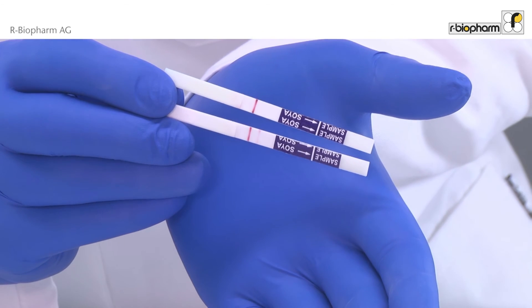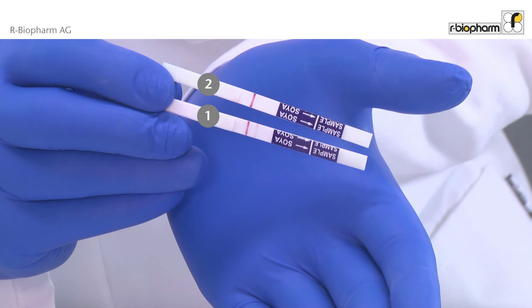The first dipstick shows 2 red lines — the result is positive, meaning the food is contaminated with soy. The second dipstick shows only 1 red line — the result is negative, meaning the food does not contain soy.